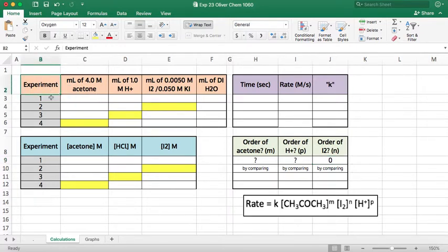All right, backing up. So we did 4 experiments. 1, 2, 3, 4. I did this back in 2012. So we didn't do experiment 1 with 2 trials. We just did experiment 1 and knocked it out. You should have 2 trials and you can average your data together. I will just be doing my 1.